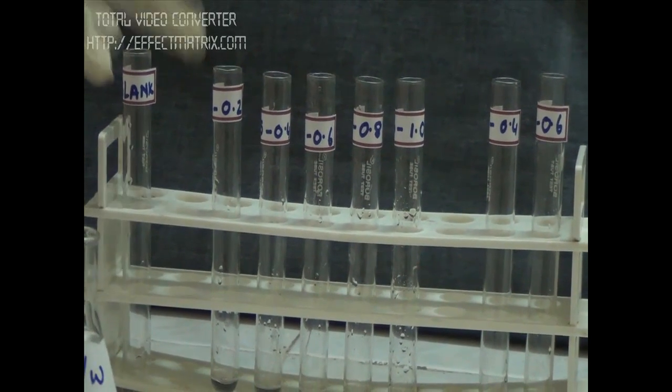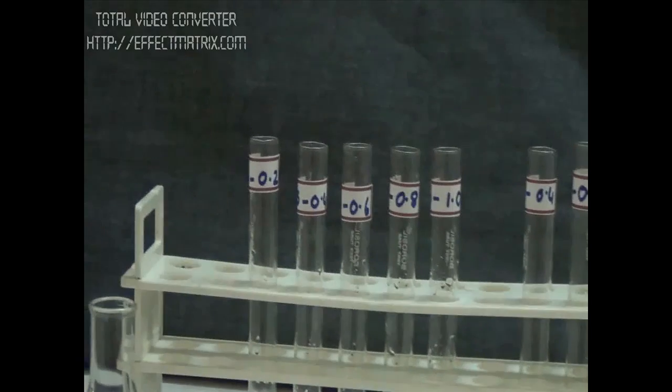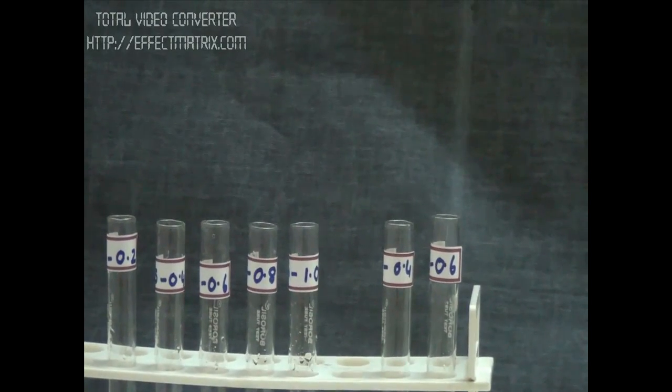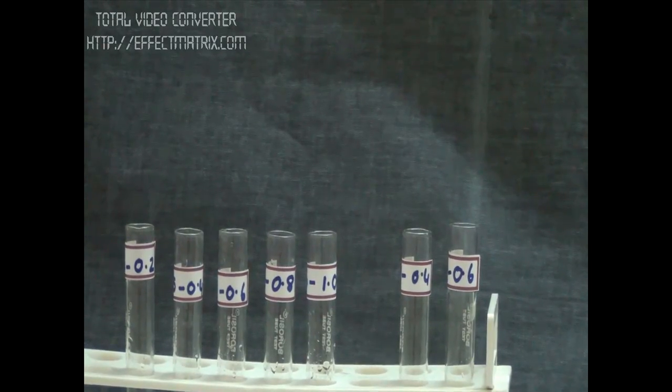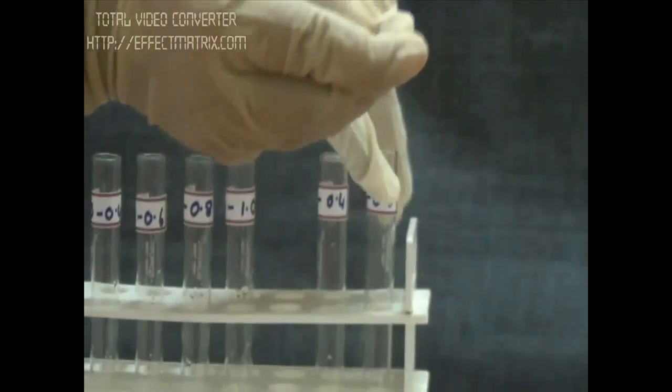But in the blank, we have to take 1 ml of distilled water. Now we add distilled water to the unknown solution to make its level also to 1 ml. We have 0.4 ml of unknown RNA solution, so I will add 0.6 ml of distilled water. Next one, we have 0.6 ml of unknown RNA, so I will add 0.4 ml of distilled water.